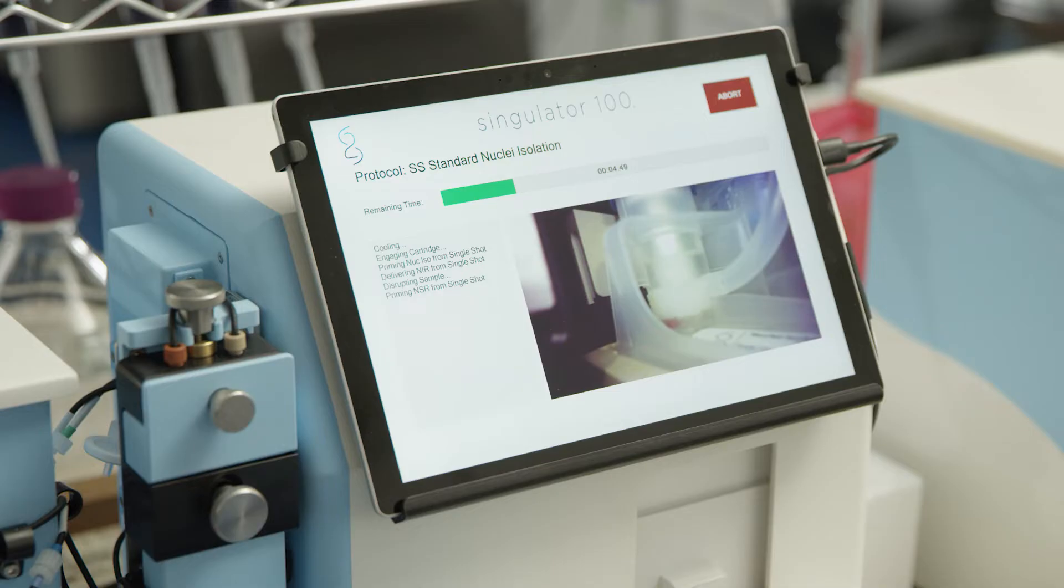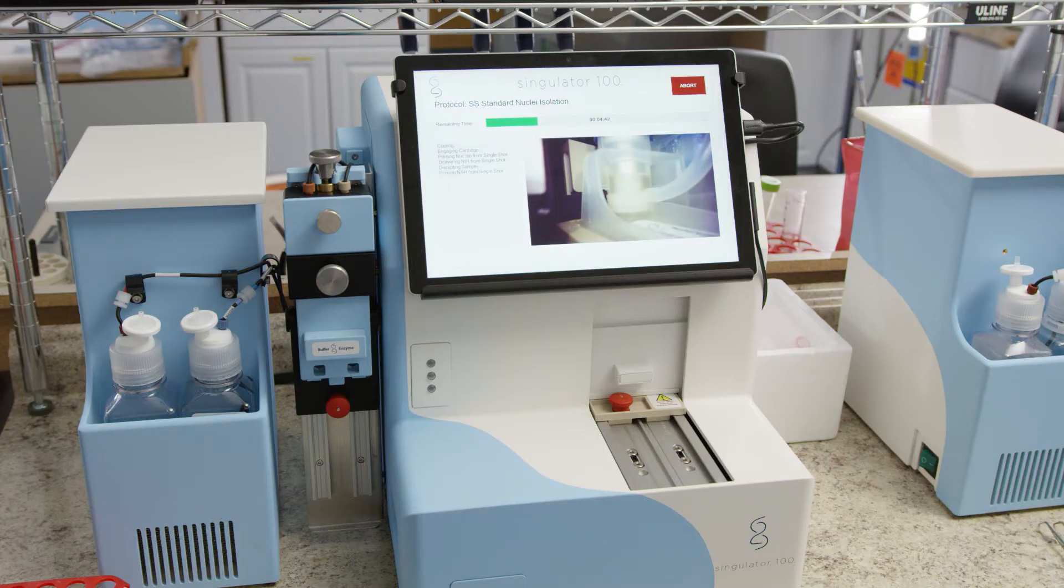The Singulator is equipped with an internal camera that allows you to view the sample dissociations in real time. These videos are archived on the Singulator and available for downloading under the Admin User section of the software.